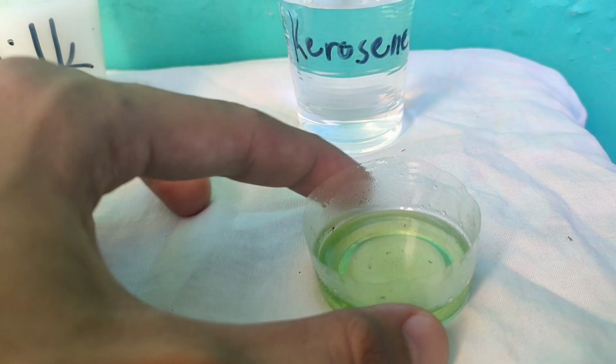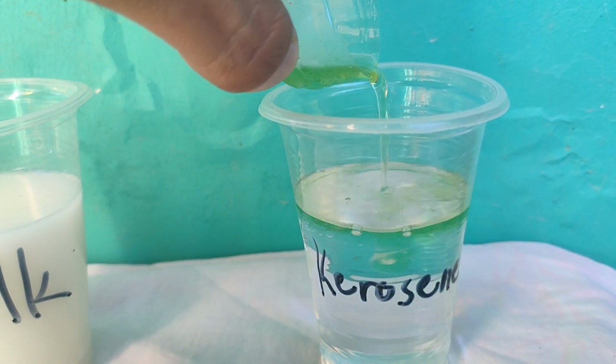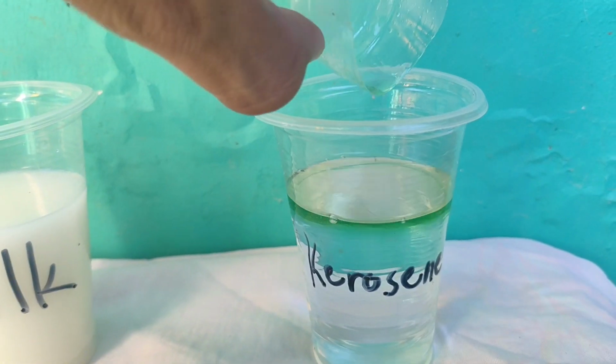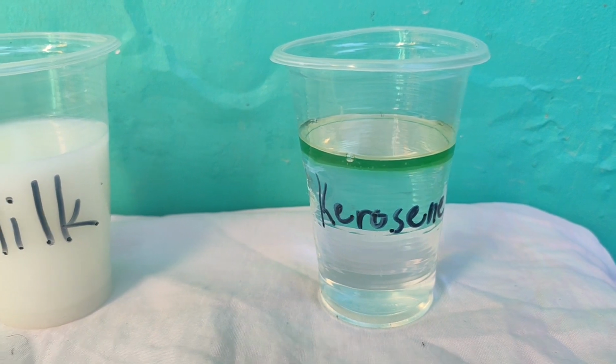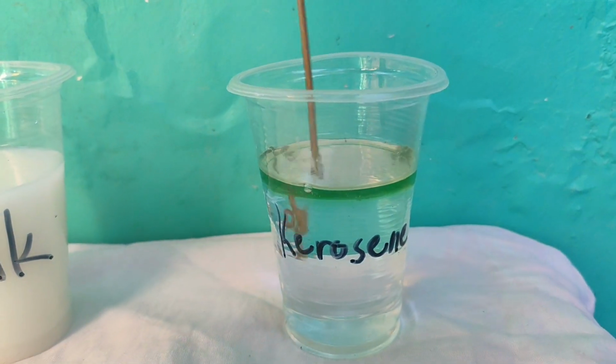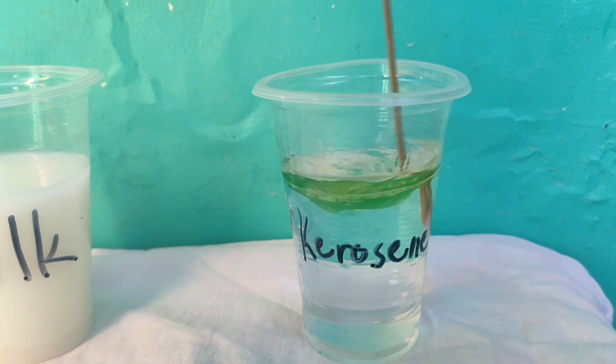And now for the kerosene, I put at least 1 tablespoon of kerosene. The same as the cooking oil, it floats on top of the water, and you mix it using the stick.